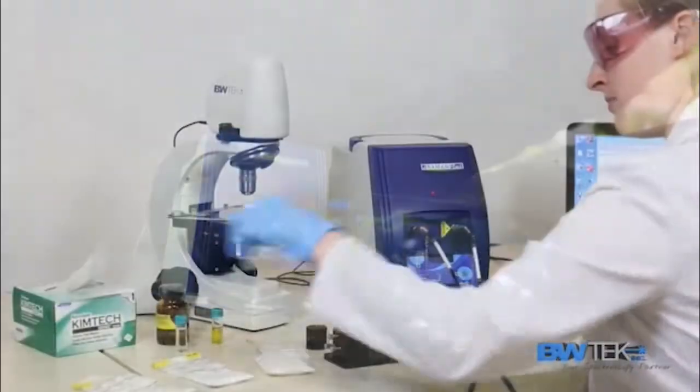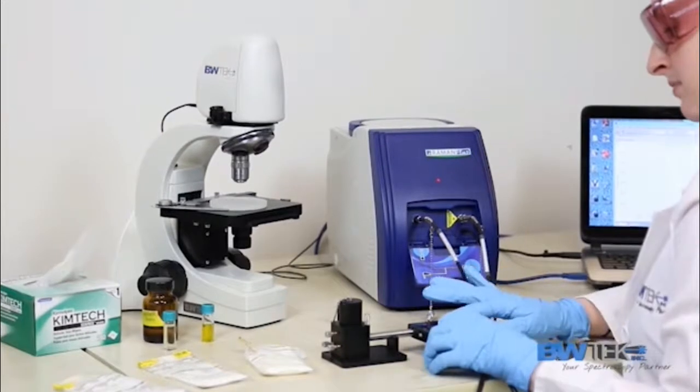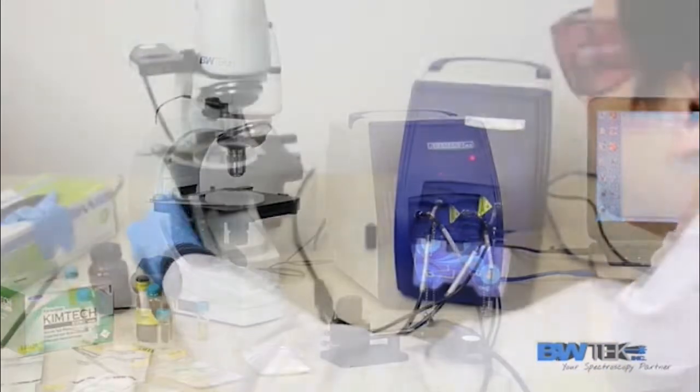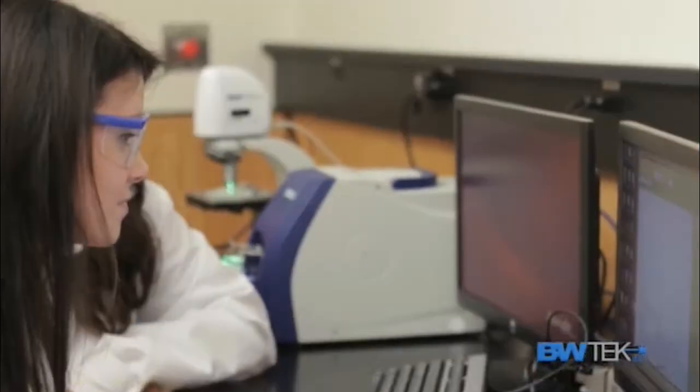When paired with a range of accessories and software, our iRamen instruments give users the flexibility to conduct advanced or fundamental research, perform lab and field testing, and fulfill educational needs.